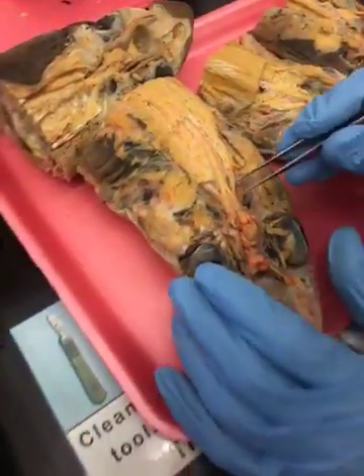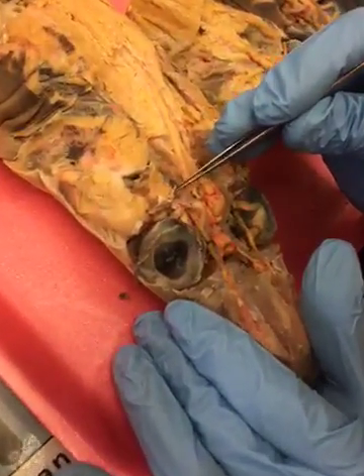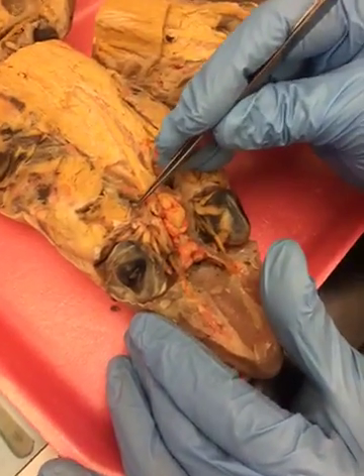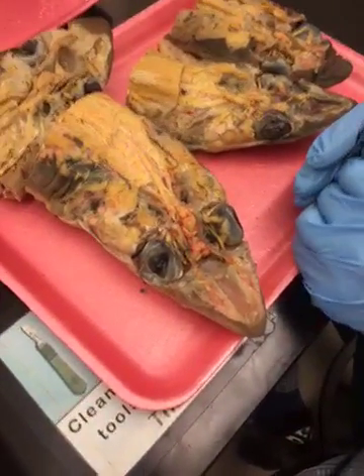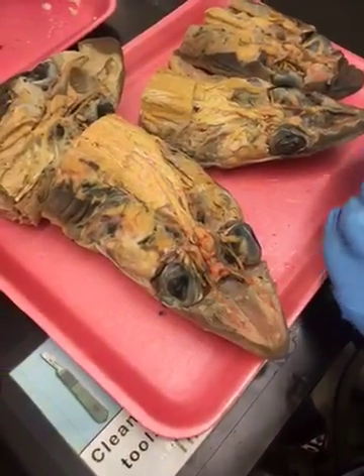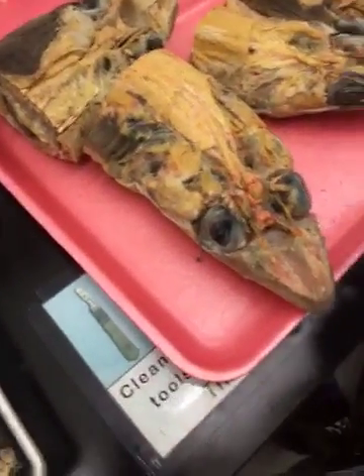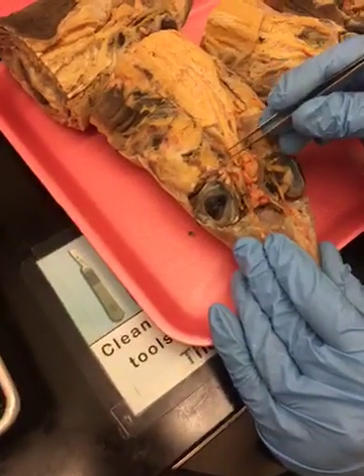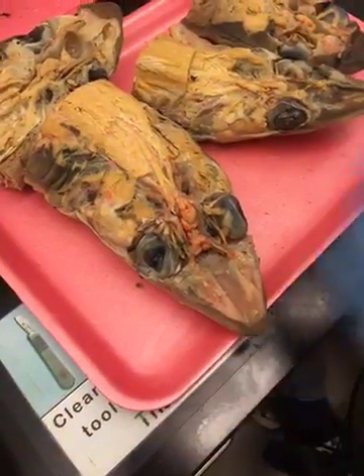Now, 8 is just a little short stubby branches that go into the inner ear here. So this is there's 8. Going into the inner ear, that's called the statoacoustic. In mammals, we call it the vestibulocochlear. Is it this guy right there? Yeah, I'd go for that. So that's 8. And then to get at the hyomandibular branch of 7, I had to cut all that away. So it's gone here. We're almost done.